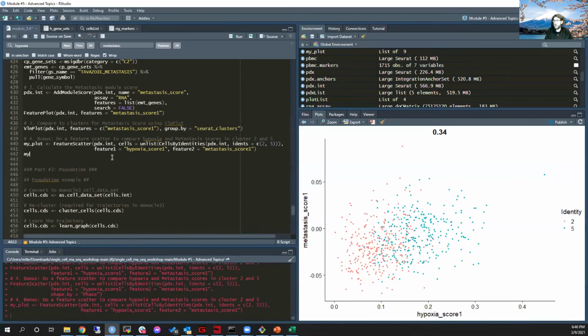So if you wanted to, and I'm not even sure how to do this to a plot that's already got stuff on it. Does anyone know how to do that? I don't know how to go back and retroactively change the aesthetic mapping because the aesthetic mapping was already set by the feature scatter command.